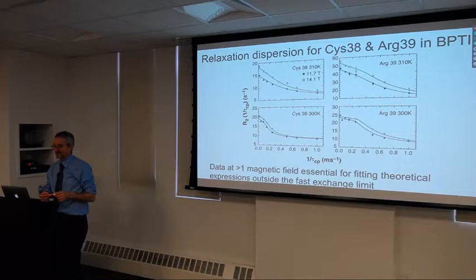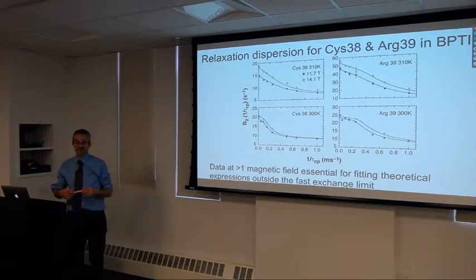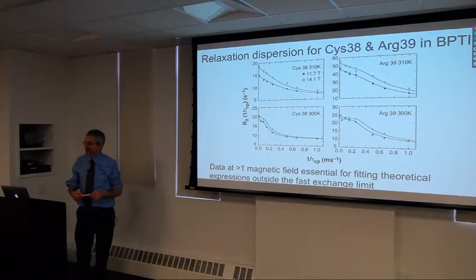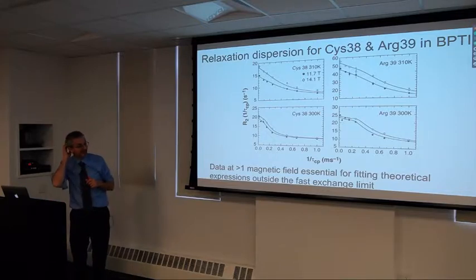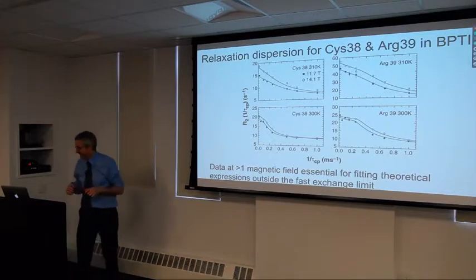And then we eventually realized actually that in the 60s, people knew there was this magnetic field dependence on exchange broadening, but they didn't really have any other magnets. So it's buried in papers and then was kind of forgotten about simply because of the limitations on magnets back in the 60s.